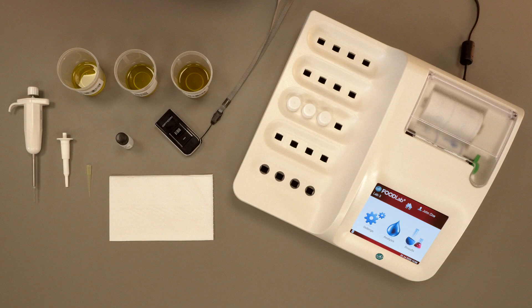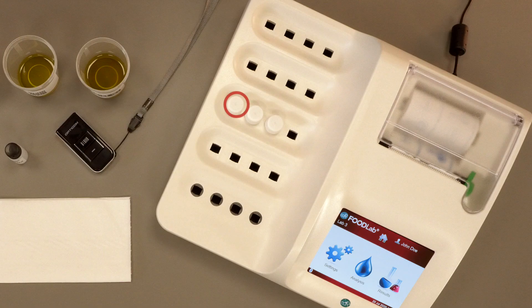Before starting the analysis, place the test tubes containing the R1 reagent into the incubation cells. For ease of use, place the R1 test tubes, taking care to memorize the position of each sample.